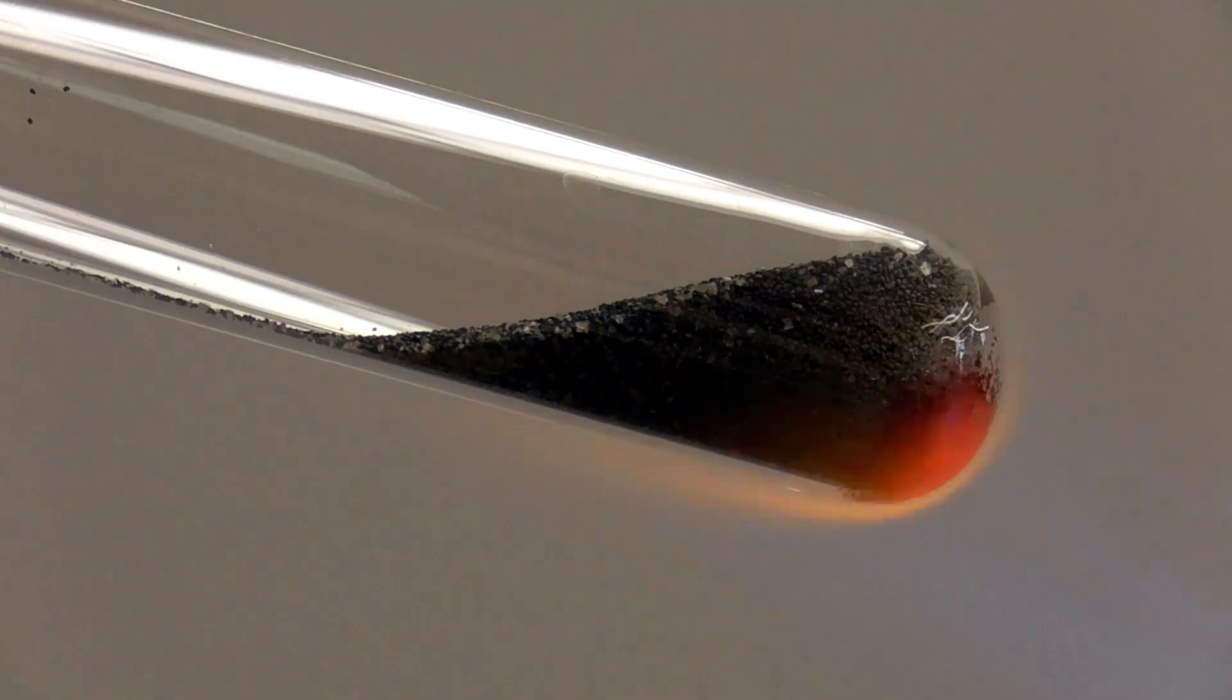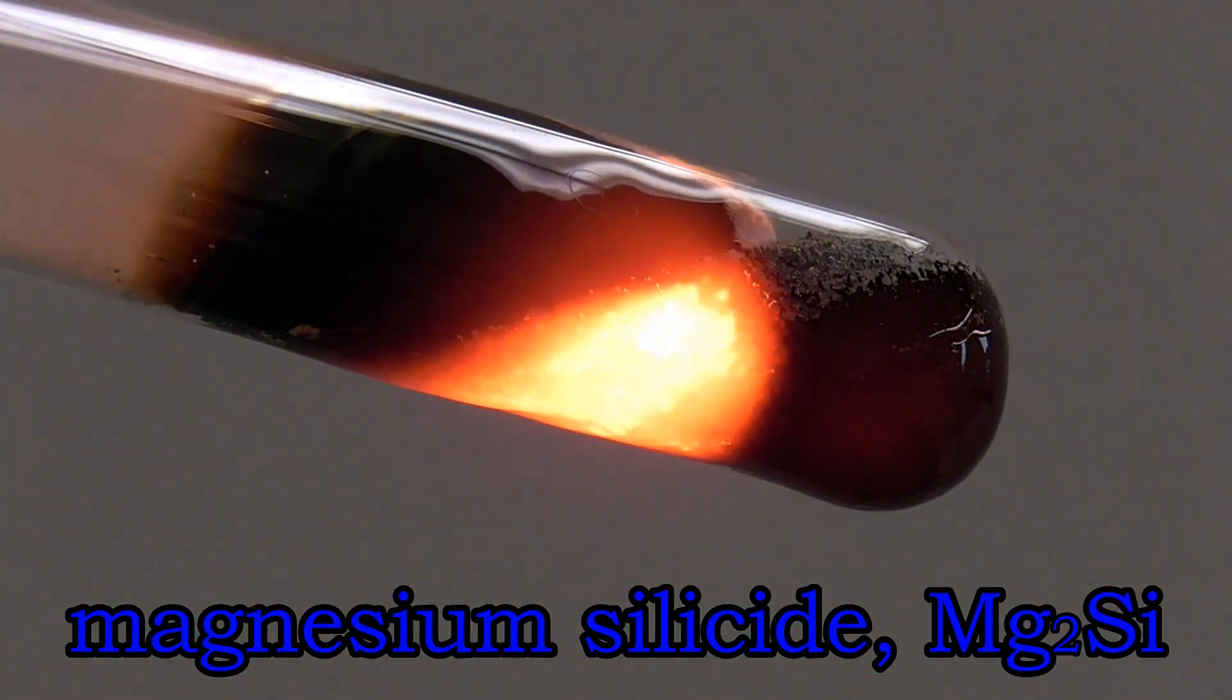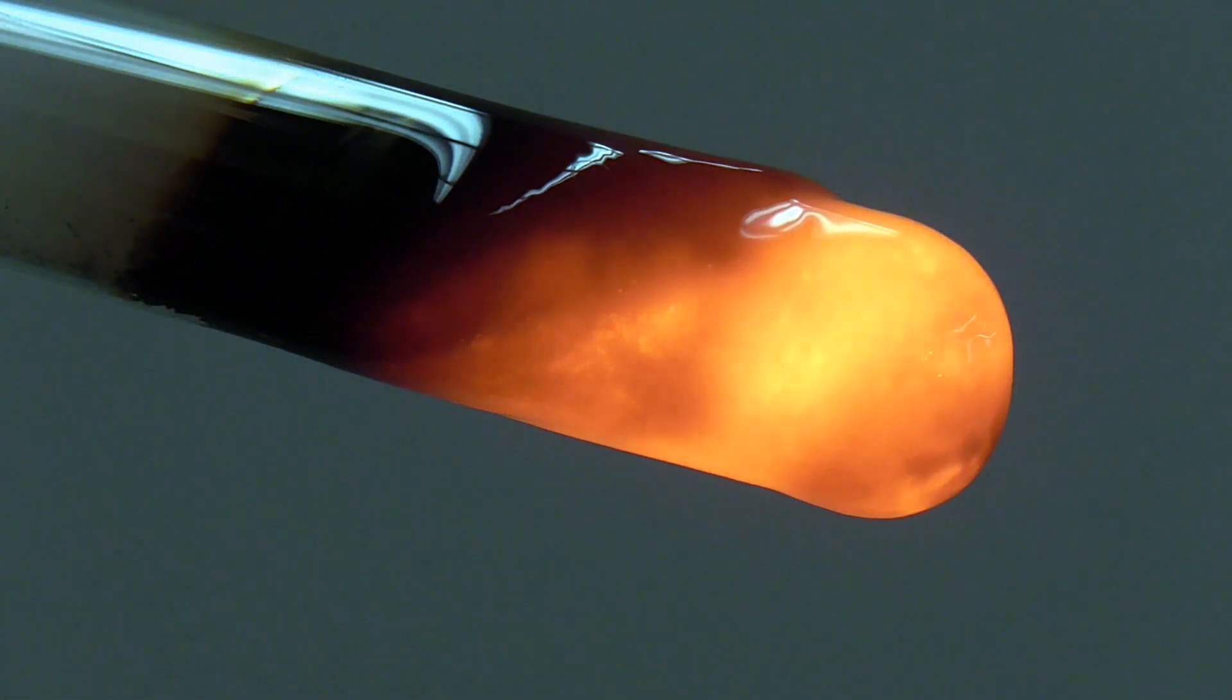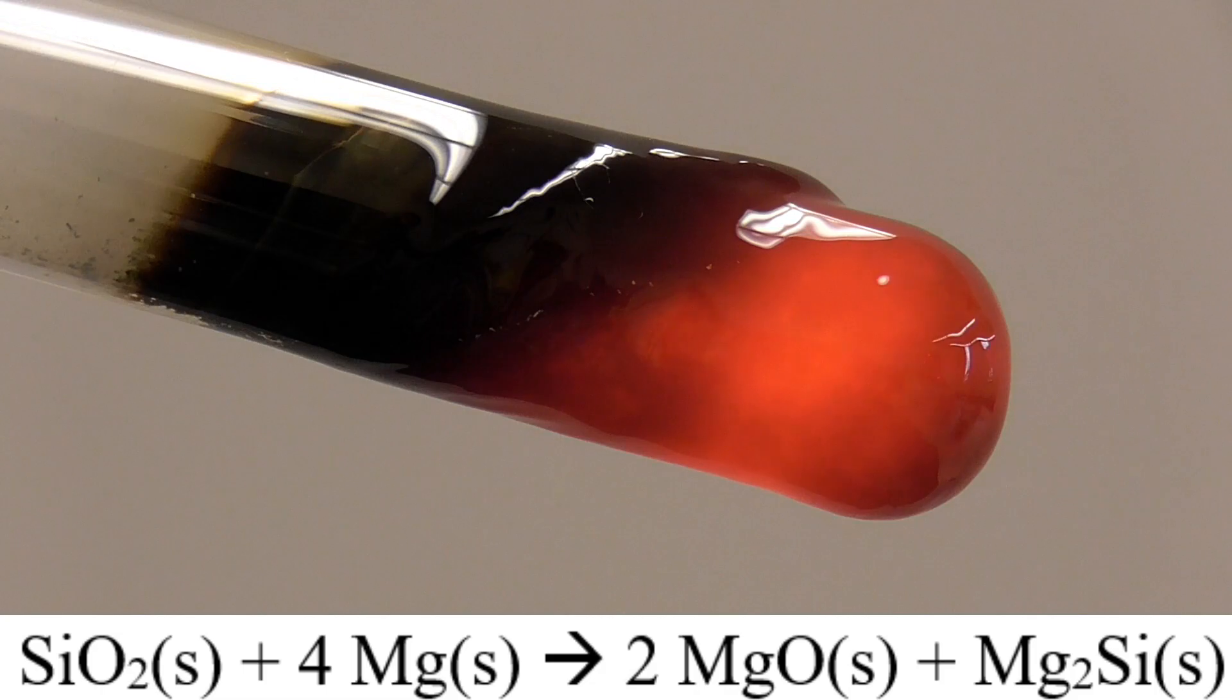In addition, magnesium silicide, or Mg2Si, is also produced due to the chemical reaction you see listed below. Like elemental silicon, magnesium silicide is black in color.